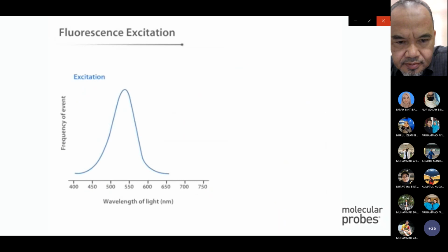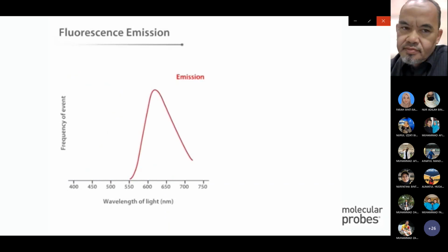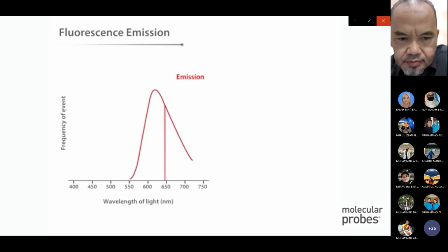A fluorophore is excited most efficiently by light of a particular wavelength. This wavelength is the excitation maximum for the fluorophore. Light with a wavelength near the excitation maximum can also cause excitation, as shown by the shaded areas, but it does so less efficiently. Fluorescence emission behaves in a similar way. The fluorescence output of a fluorophore is most likely to occur at a particular wavelength. This wavelength is the emission maximum for that fluorophore. The excited fluorophore can also emit light at wavelengths near the emission maximum, as shown.